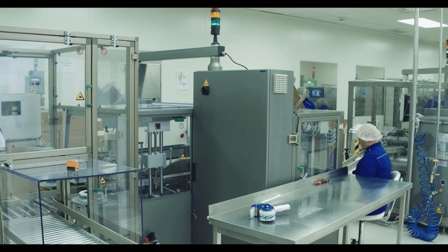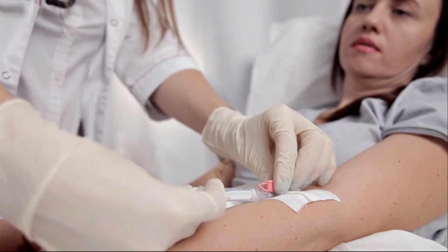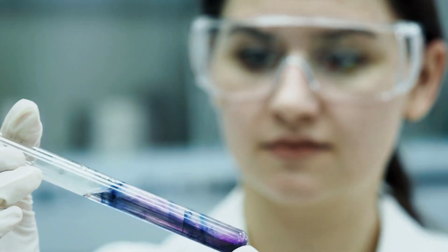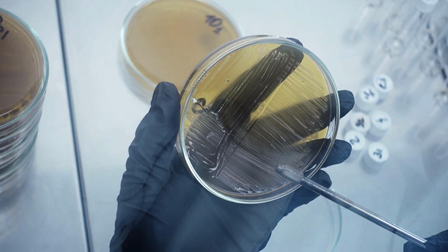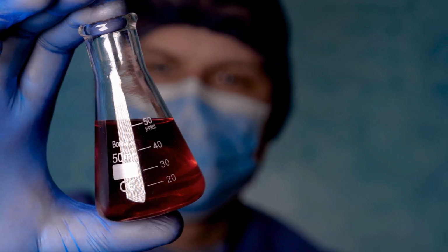Once these techniques are learned in the laboratory, they apply to almost every phase of patient care, especially to the collection and handling of specimens that are critical if the laboratory is to make a diagnosis of an infectious disease. These specimens should be handled as carefully as cultures, so that they do not become sources of infection to others.